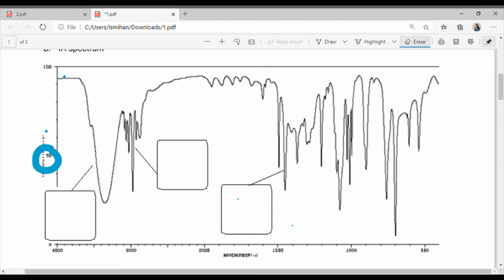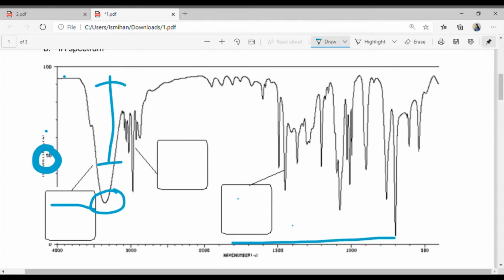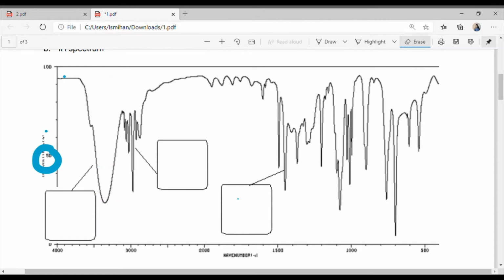Whereas down here, we see up to 25% only transmittance happening, meaning that the 75% is absorbed. Same thing down here, we only see 5% transmittance, which means that the other 95% has been absorbed in some molecule. And the analysis of these dips, and whether they be broad or sharp signals, is what we analyze in infrared spectroscopy, because we're looking at what molecules are present to absorb in that shape.